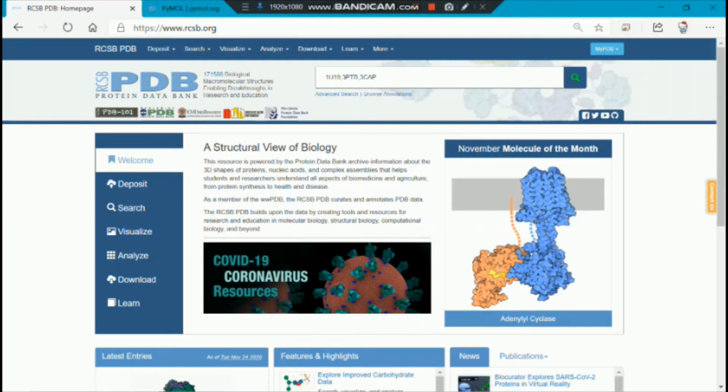So these are the 3 PDB entries which we are going to use for this particular tutorial, and I suggest you download these PDB files in the PDB file format. Although we could use any other file format because there are varied types of file formats which are supported by Pymol software, we will preferably use the .pdb extension, right?